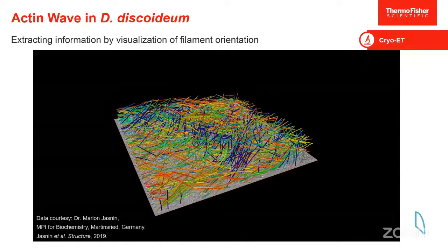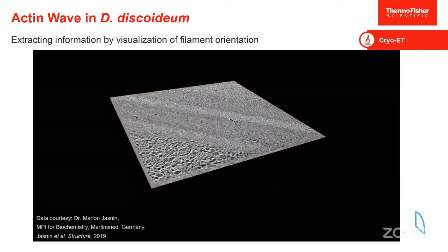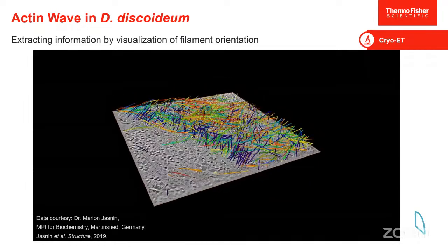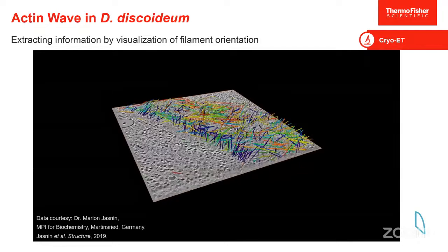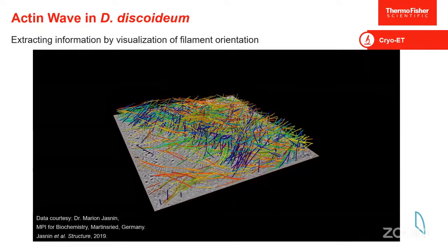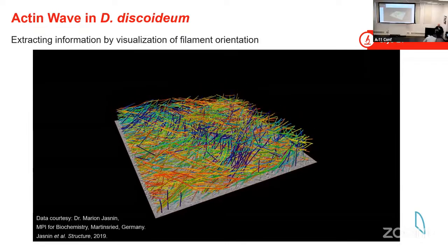So you can quantify how many branching points you have on a single structure. Depending on what you're looking for, if you know you have a lot of branching structures, you should probably use that autoskeleton type of analysis. But if you think you have individual fibers, then you can just segment them and quantify the individual segments as themselves. Okay, awesome. Thank you.